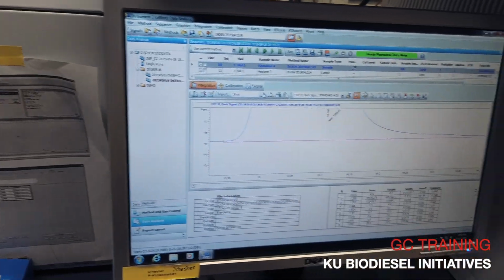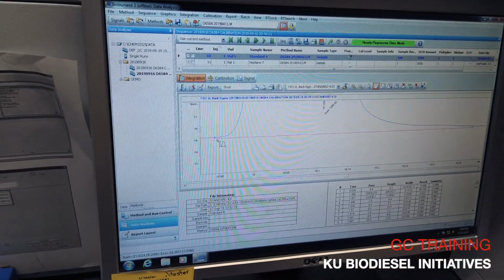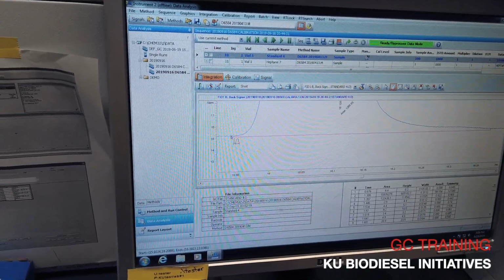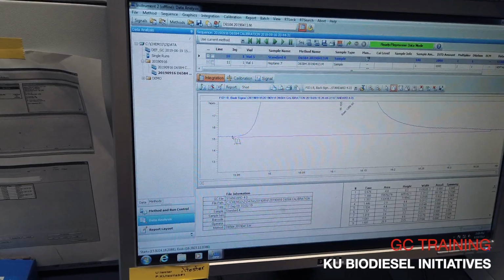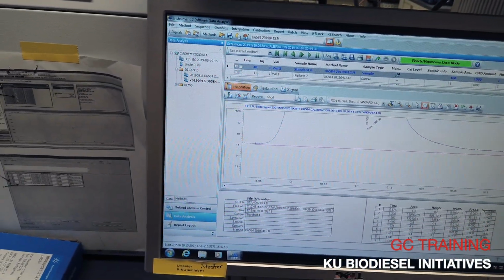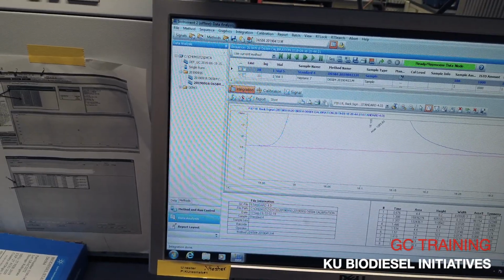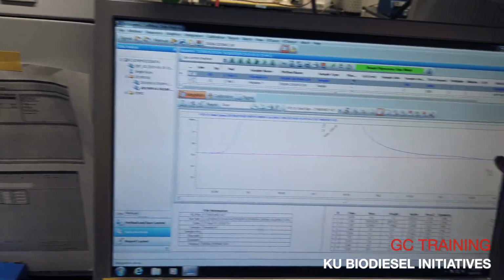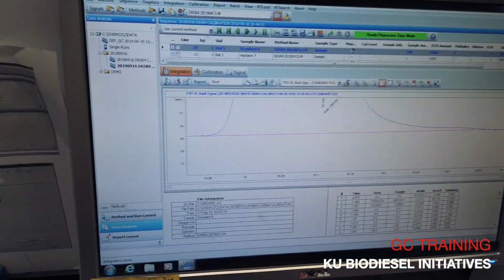Did it a little under, so I'm going to use the same retention time, but I'm just going to bring it right up to the baseline, because I don't want to add any additional peak area if I don't have to. So yeah, that's what I'm looking for. I want it to be straight up to there, straight up to there. I basically want it to look like the baseline is shooting out of it.